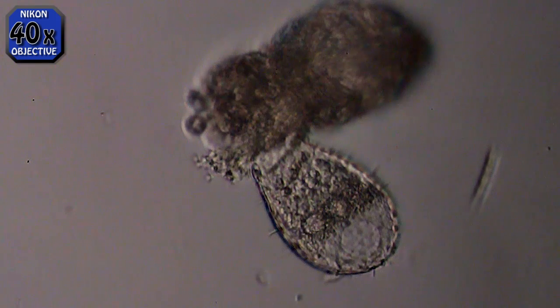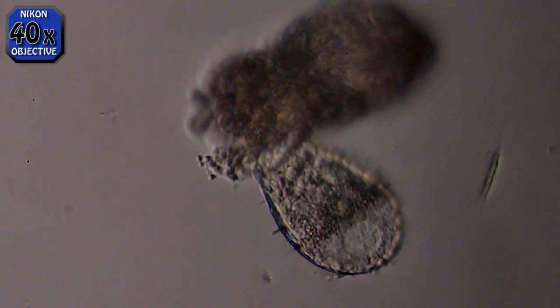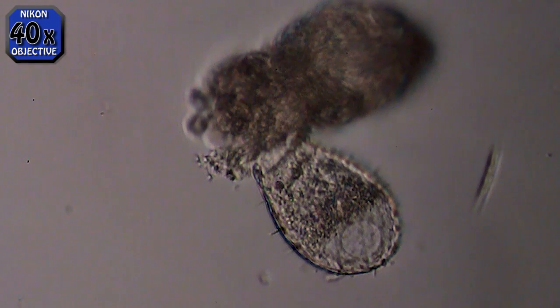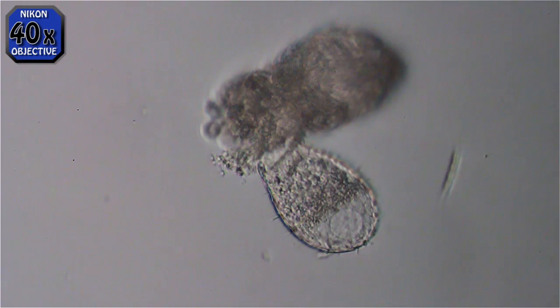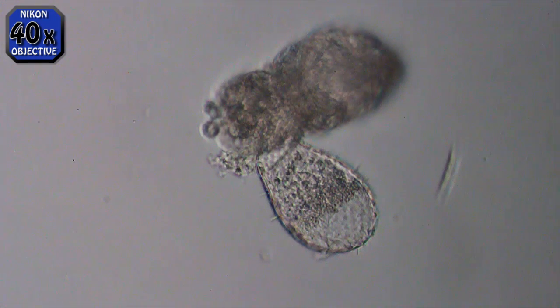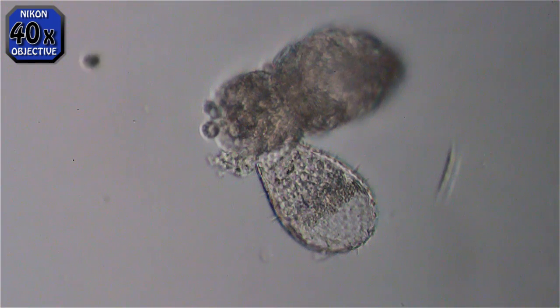I'm using a 40x bright field Nikon lens here. As I focus through the depth of him, if you look at the vacuole thing there you'll see 3 or 4 little dark dots going across vertically at this point — 4 little dots. I believe those are his micro nuclei, which I've just kind of learned how to identify. I could be wrong, but I think that's what those are.